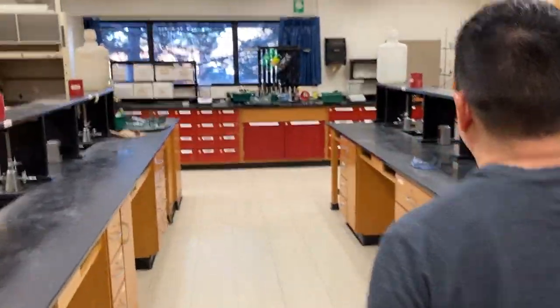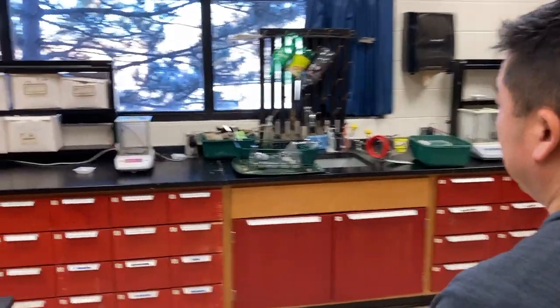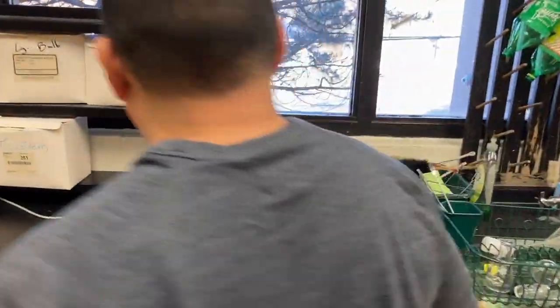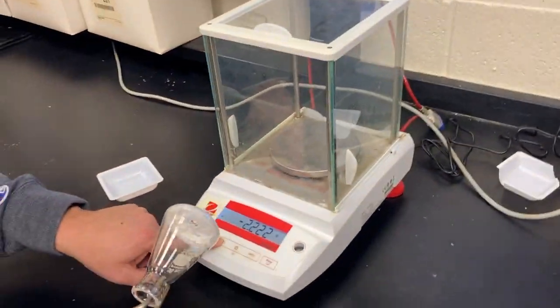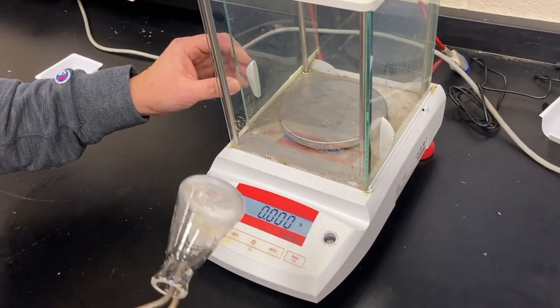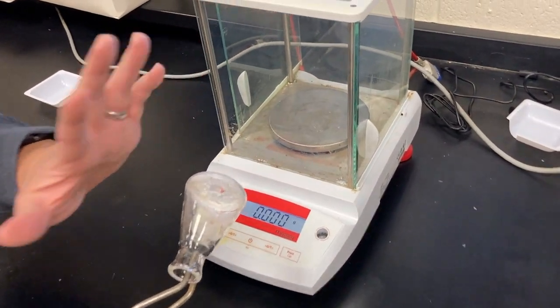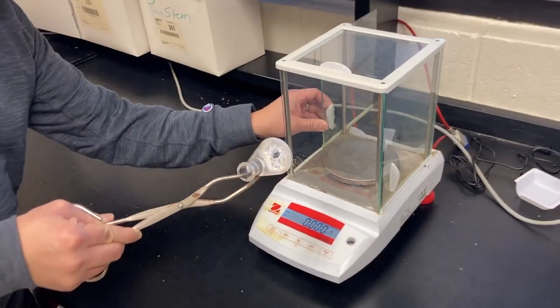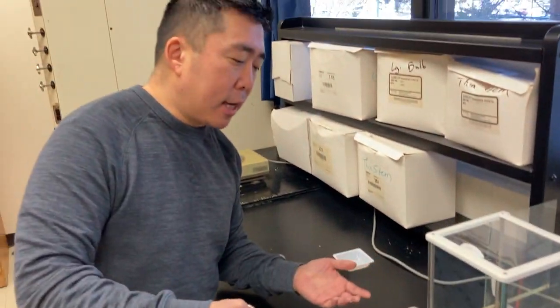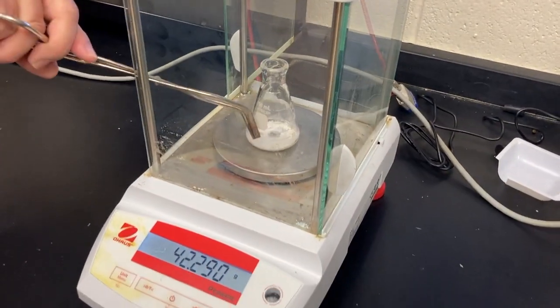Hello, Miss Fiore. Now, there was a scale right over there by the fume hood, Mr. Park. Why are we going all the way back over here? Well, you have to use the same scale because it's calibrated exactly the same way. If we use a different scale, the internal calibration might cause this to appear a different weight than it actually is. It's just like if you weigh yourself, if you're on a diet, you would use the same scale. Diet sounds terrible.